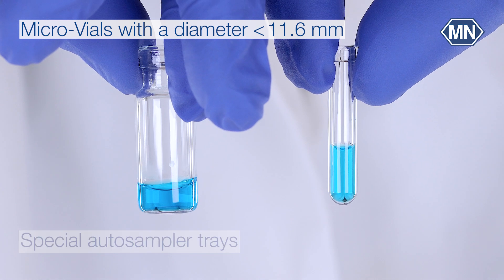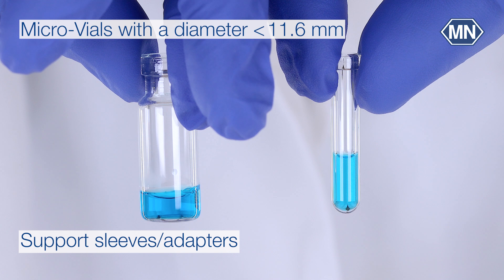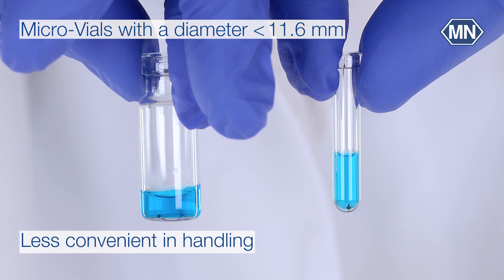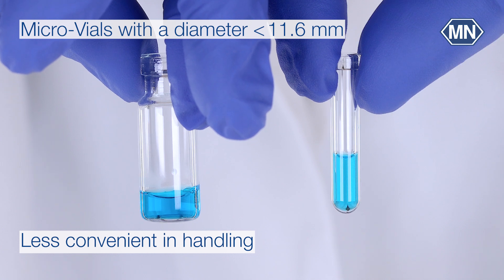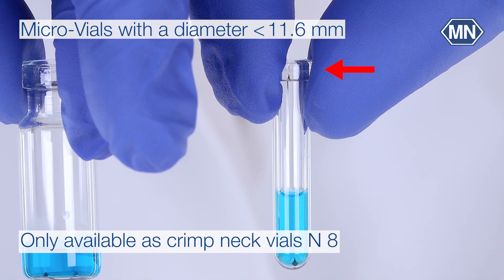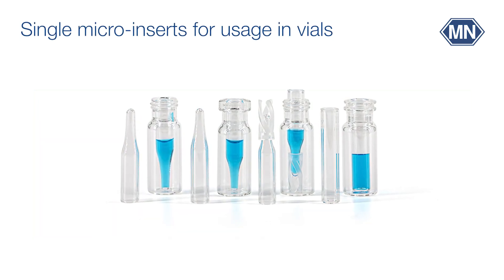Depending on the instrument, special autosampler trays might be required. Support sleeves or adapters may be required to offer a standing position in the autosampler, making these less convenient to handle than standard sample vials. They are only available as crimp neck vials, size 8.